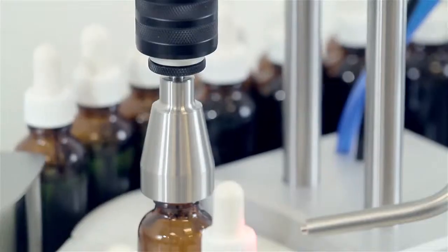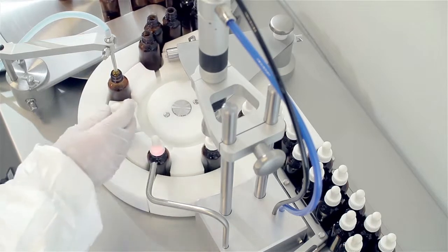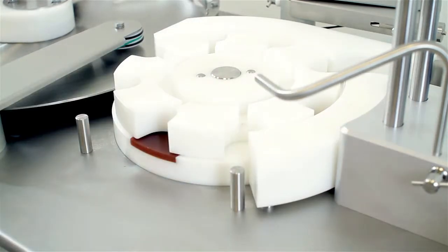The FlexFeed 30 provides consistent cap torques that reduce the problems of leaking bottles whilst protecting operators from painful repetitive strain injuries. A complete bottle and cap changeover can be completed in less than 5 minutes.